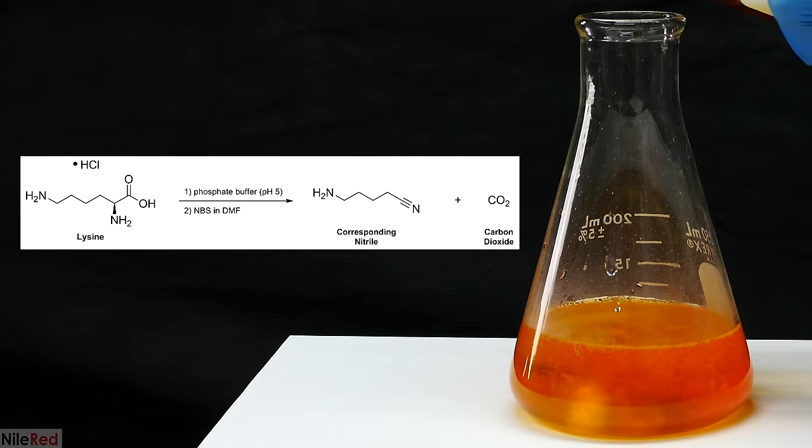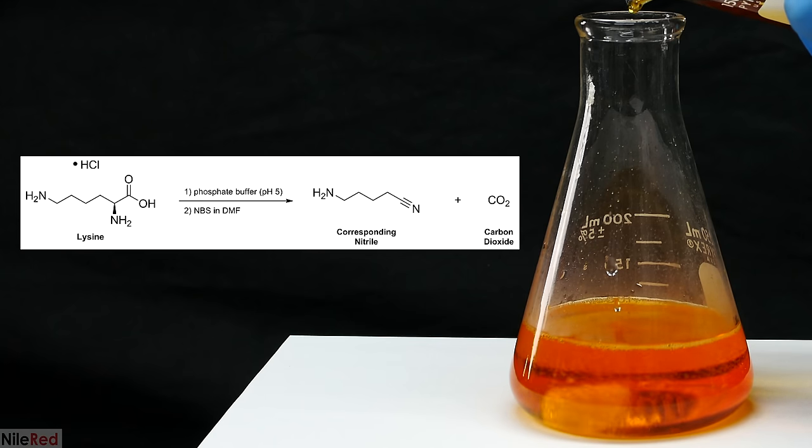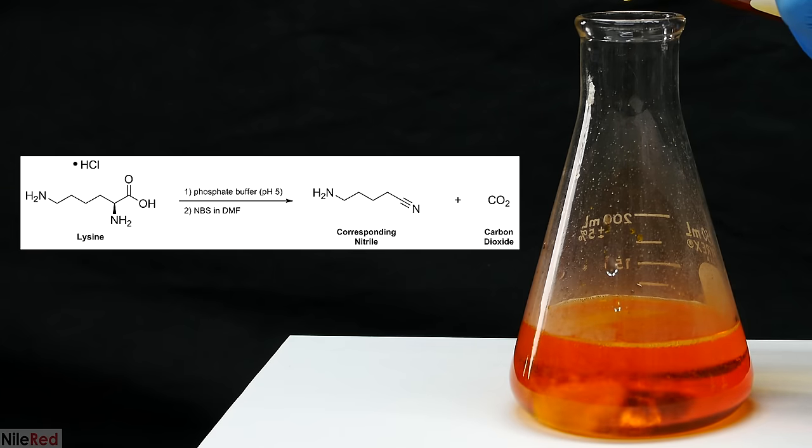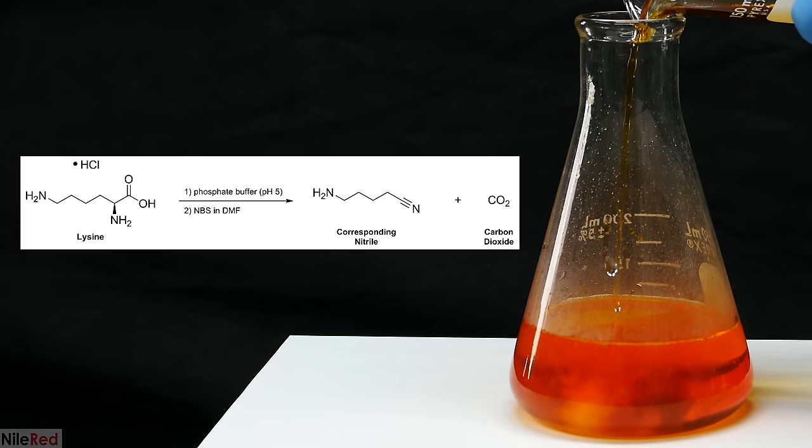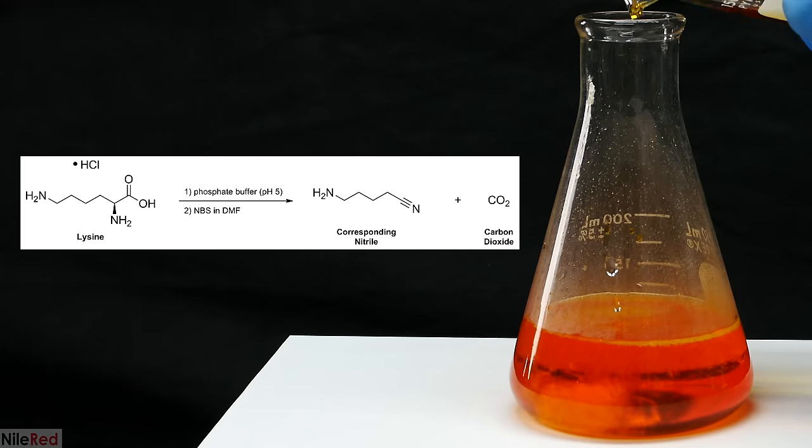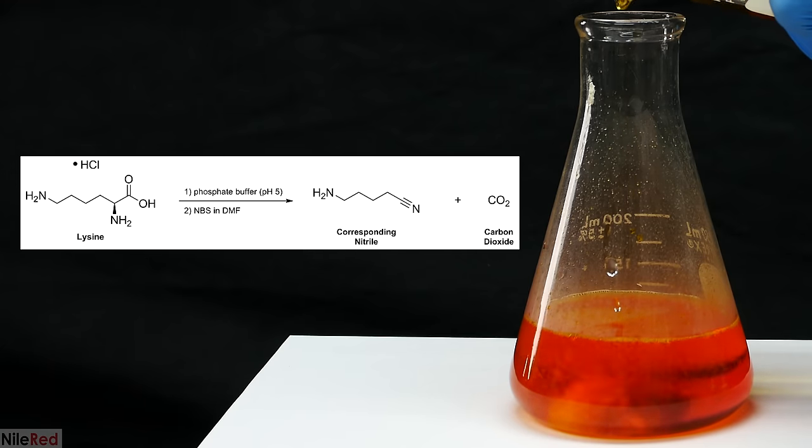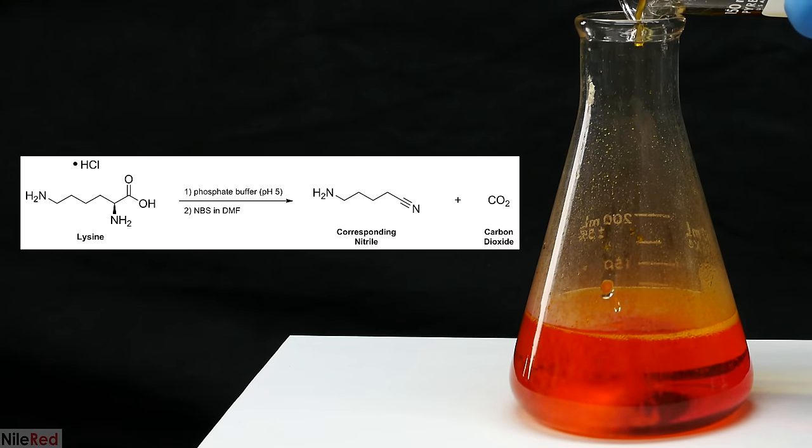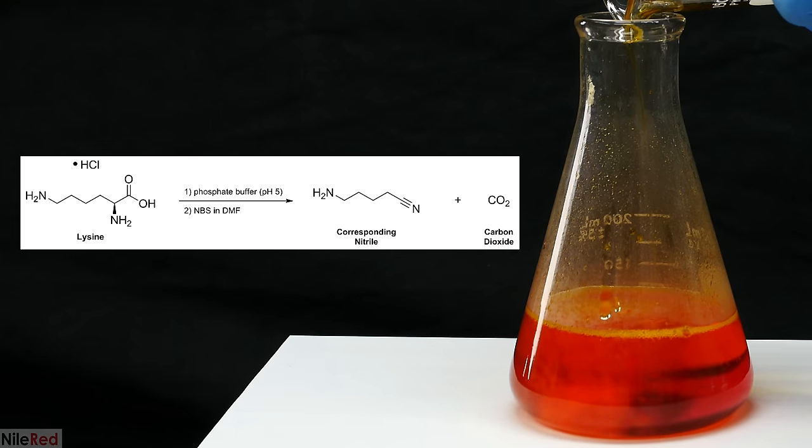According to the paper, this is the step that the pH buffer was important for, because if the pH wasn't controlled and kept around 5, it would produce an aldehyde instead of our desired nitrile. The procedure in the paper didn't say anything about adding it slowly, and I just chose to do this, but as I was editing and I re-read the paper, there was a mention in the introduction that they added the NBS solution dropwise.